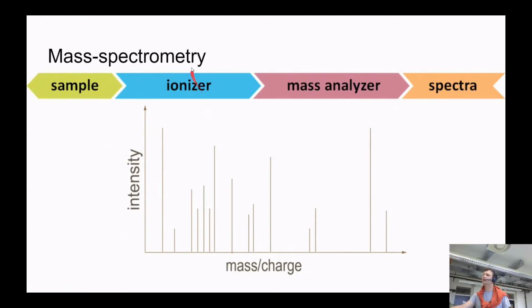And probably, if I say mass spectrometry, you have already heard about the instrument. This instrument is used a lot, especially in airports. For example, when I was flying recently from Marseille, an officer came to me, checked a piece of paper and put it in my luggage, and later took this piece of paper and brought it to the instrument.